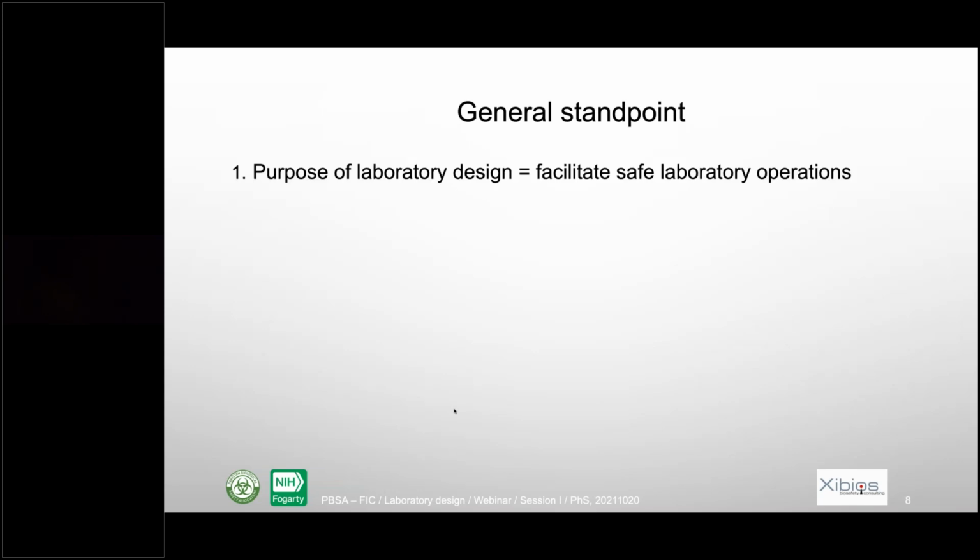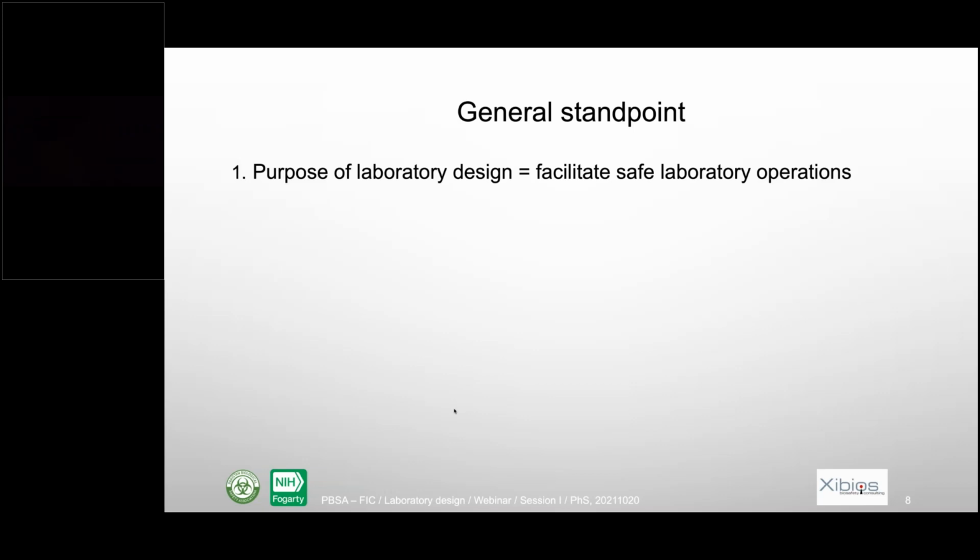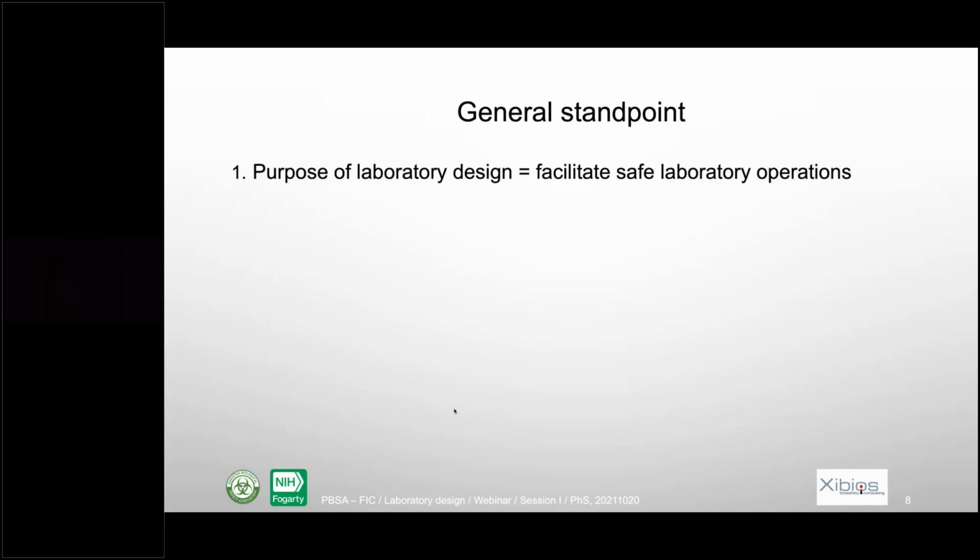So the general standpoint for this webinar, which comes from WHO, is that the purpose of laboratory design is only to facilitate safe laboratory operation. It's not the purpose to have a nice fancy laboratory and so on. The purpose of the laboratory design is to have a lab that allows safe laboratory operations.